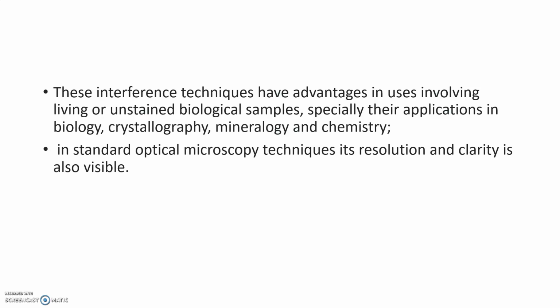Compared to standard optical microscopy techniques, its resolution and clarity are also better. So this has important applications in biology, crystallography, chemistry, etc.